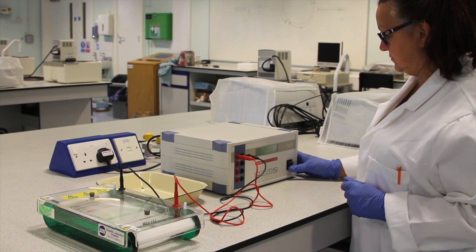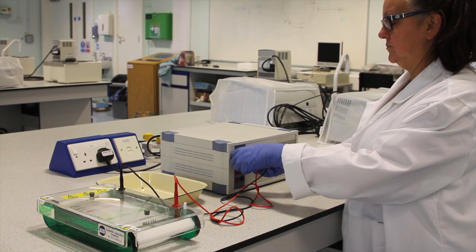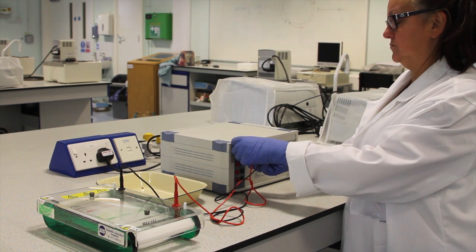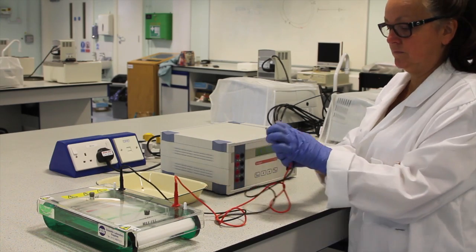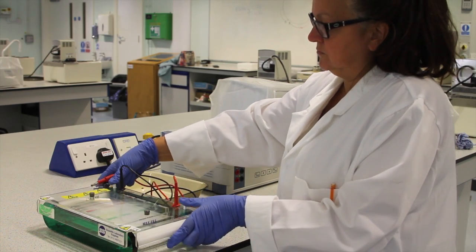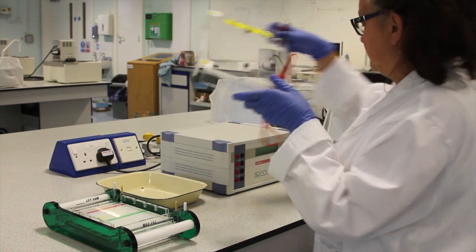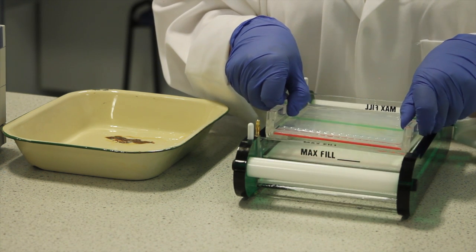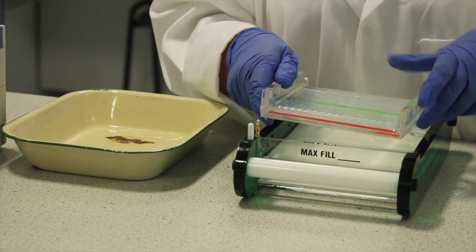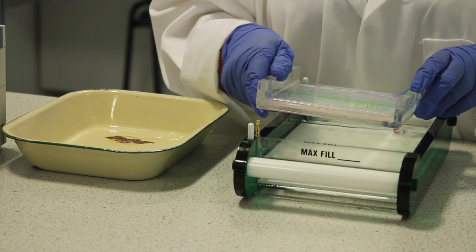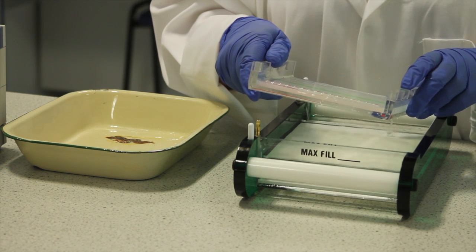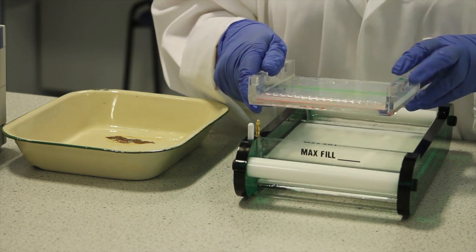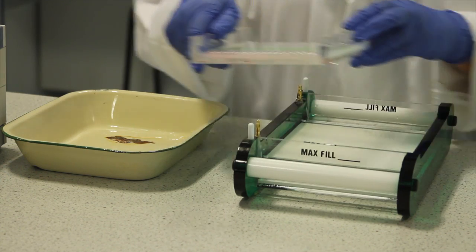Once the gel has run, turn off the power supply. Remove the leads and carefully remove the lid from the gel tank and place it on the bench. You should now remove the gel, tipping it slightly to drain the excess buffer, whilst ensuring you do not allow it to slide off its casting stand, and then place it in a suitable container.